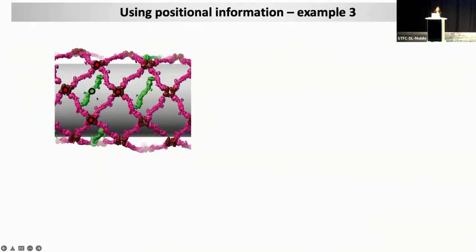I'm not going to go into the biology at all, but when we plot the position of the red neighbors compared to each one of the green particles, we find that there are these four peaks, which are expected, but then we also see an extra peak that we didn't expect, and we wouldn't have spotted just by looking at the structure or the data, because it's a minority of particles.